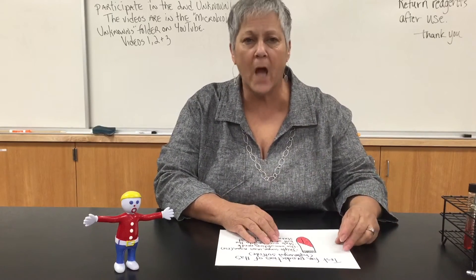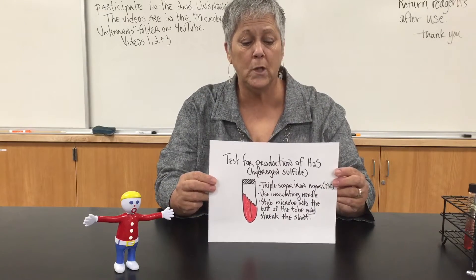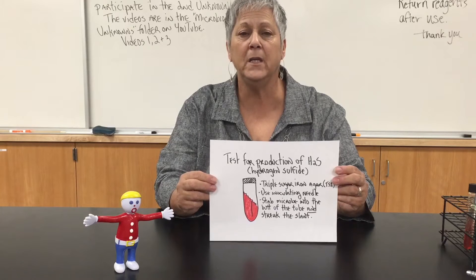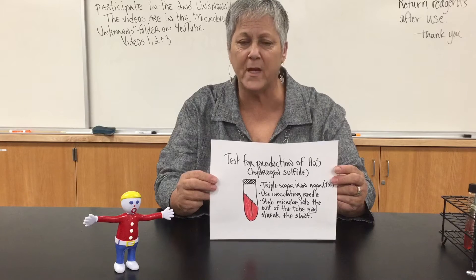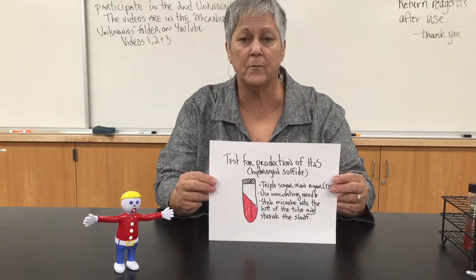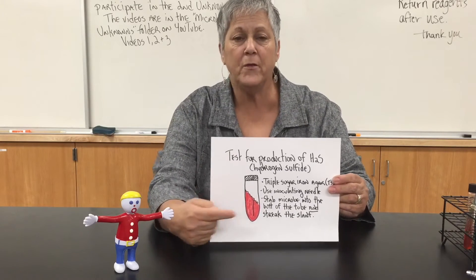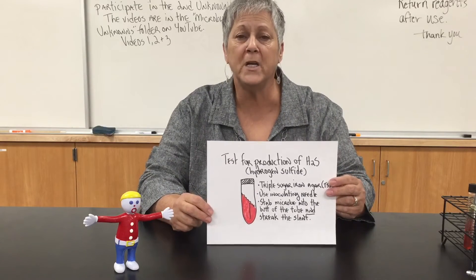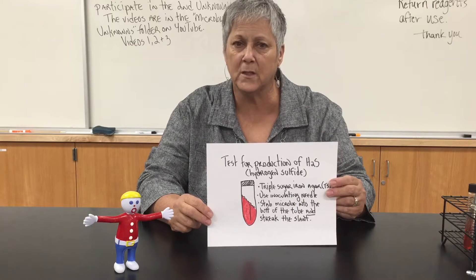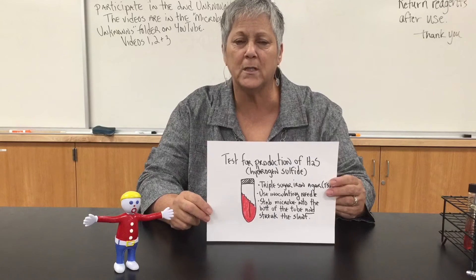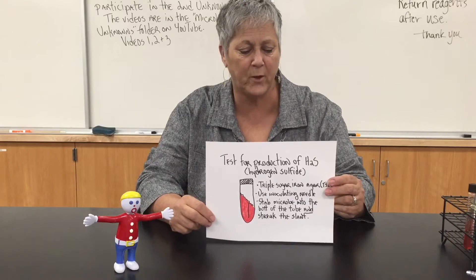Let's talk about inoculating TSI, or triple sugar iron agar. You're going to use your inoculating needle rather than your loop. Before you flame your needle, straighten out the wire, flame it, remove a little bit of the organism from the slant that the lab tech provided you with, and then you're going to stab the organism into the butt of the tube. As you withdraw the needle, you also streak the slant. It's really important that you get some of the organism under the surface of the agar, trapped in the bottom part of the butt of the tube.